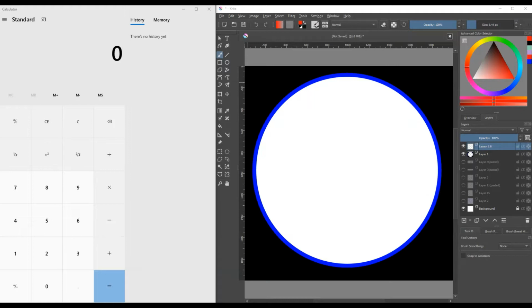The thing to note about this is when your microscope's objective lens is set to 4 times, the diameter of this circle is going to be 4.4 millimeters. And when the objective lens is 10 times, it will be 1.75 millimeters across the field of view. And finally, when you switch your objective lens to 40 times, it's going to be 0.44 millimeters across the screen. We'll see this in a few examples today, starting with the first one, a paramecium.